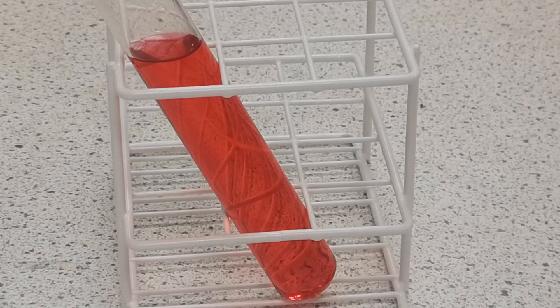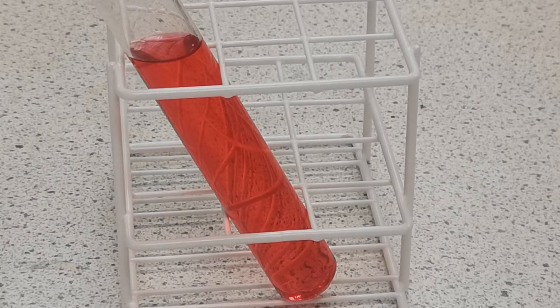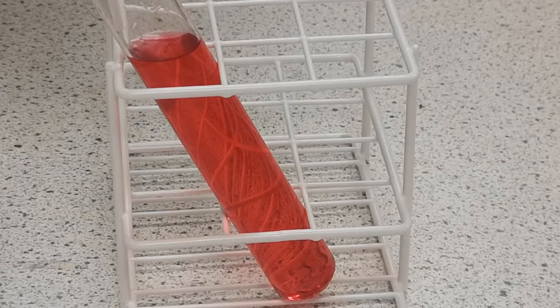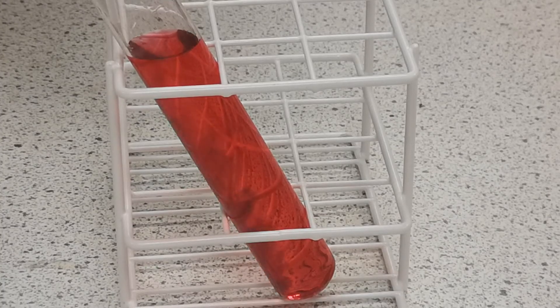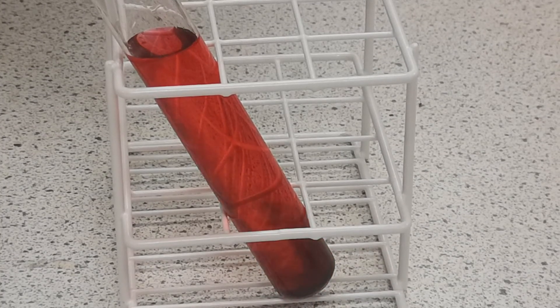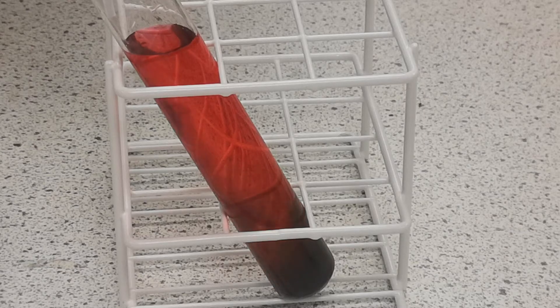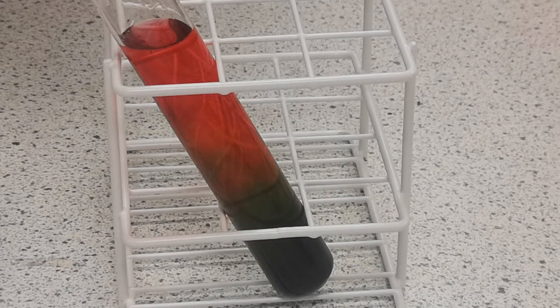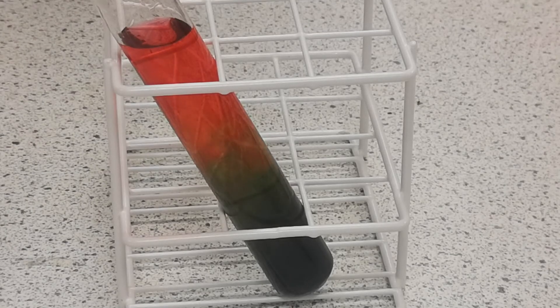Now you need your alkali. This version uses a saturated solution of sodium carbonate. Tilt your tube and add some of your sodium carbonate down the side of it. The amount will depend on the size of your container — this particular test tube is taking about 5 or 6 millilitres.